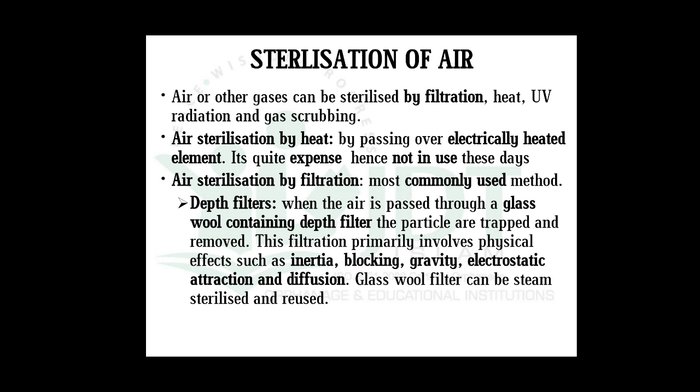Now, we have discussed in the working of the fermentation process that we have to give aeration in order to give fresh oxygen and to remove contaminating or exhausted carbon dioxide from the fermenter. So while giving oxygen or aeration, we have to make sure that it is sterile, free from contaminating microorganisms.